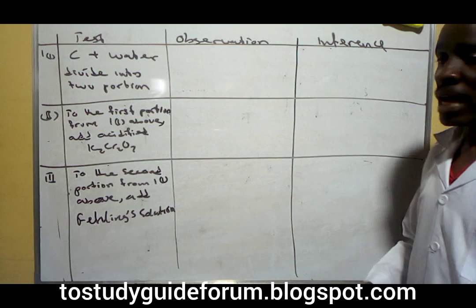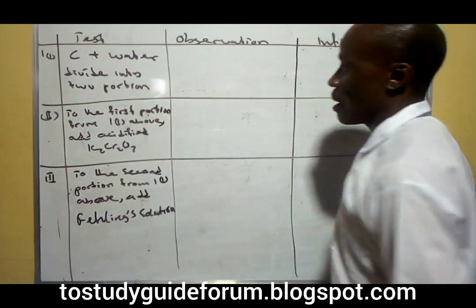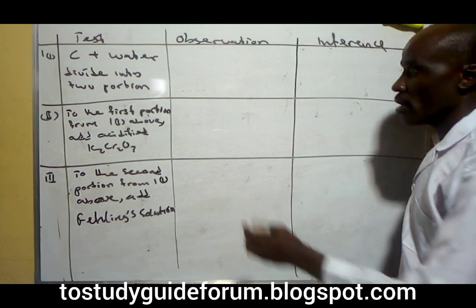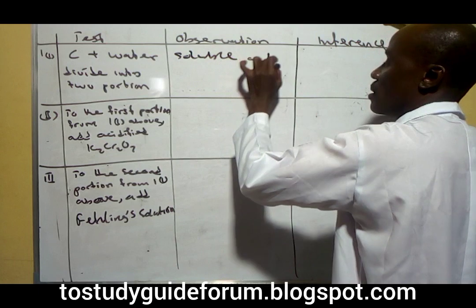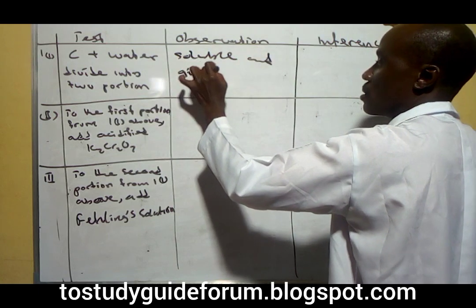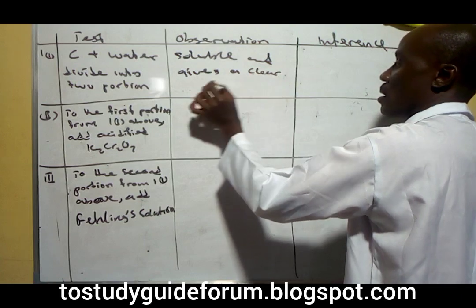So based on this test I have on the board, C plus water, you find out that you have a soluble, clear solution.